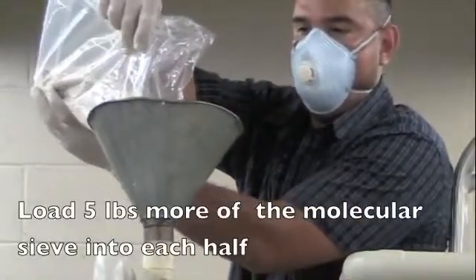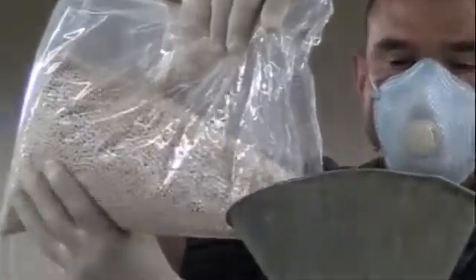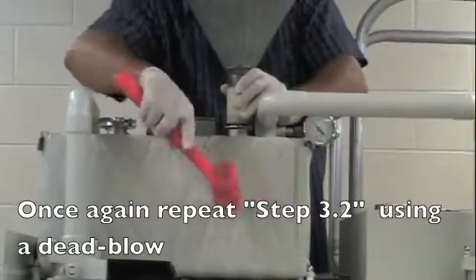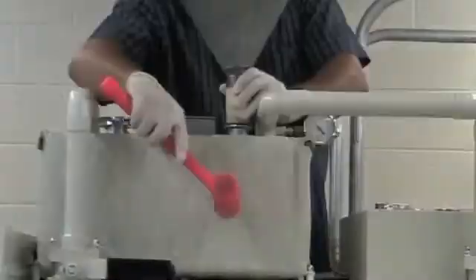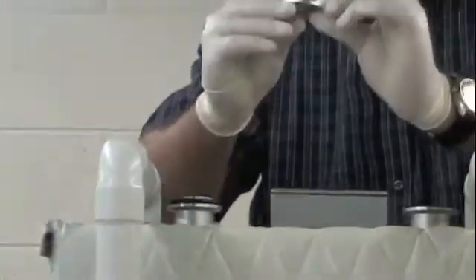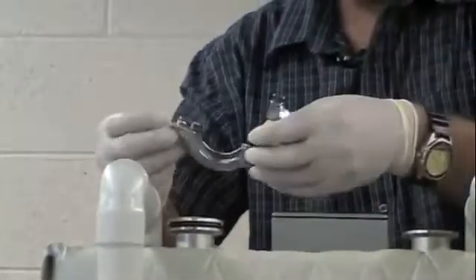Lastly, load another 5 pounds of molecular sieve into each half of the purifier. Install the centering rings and blank off plates to both purifier fuel ports, and tightly secure them in place with the wing clamps.